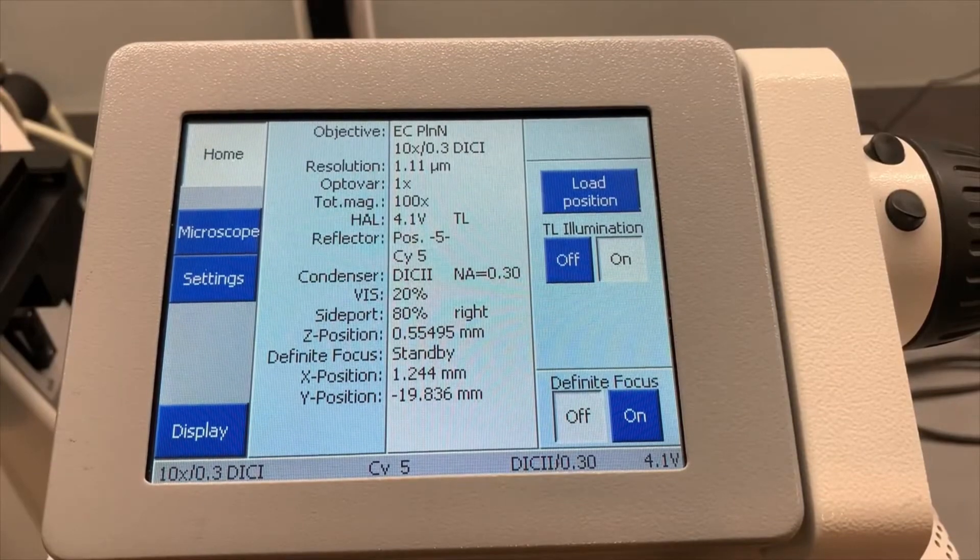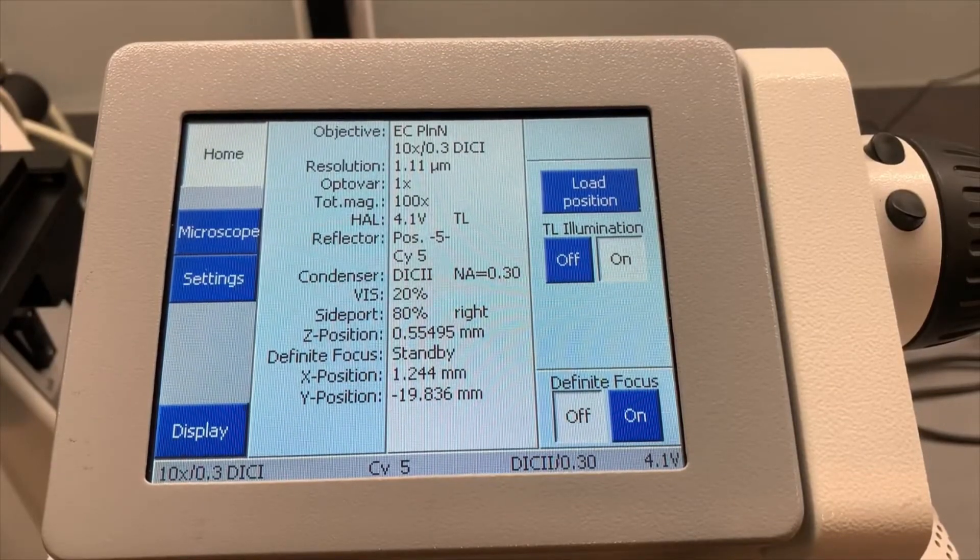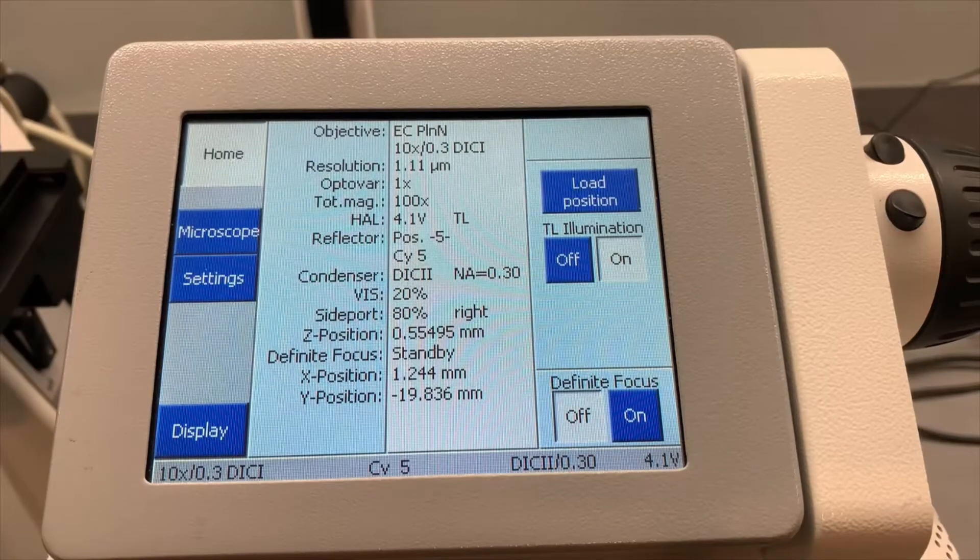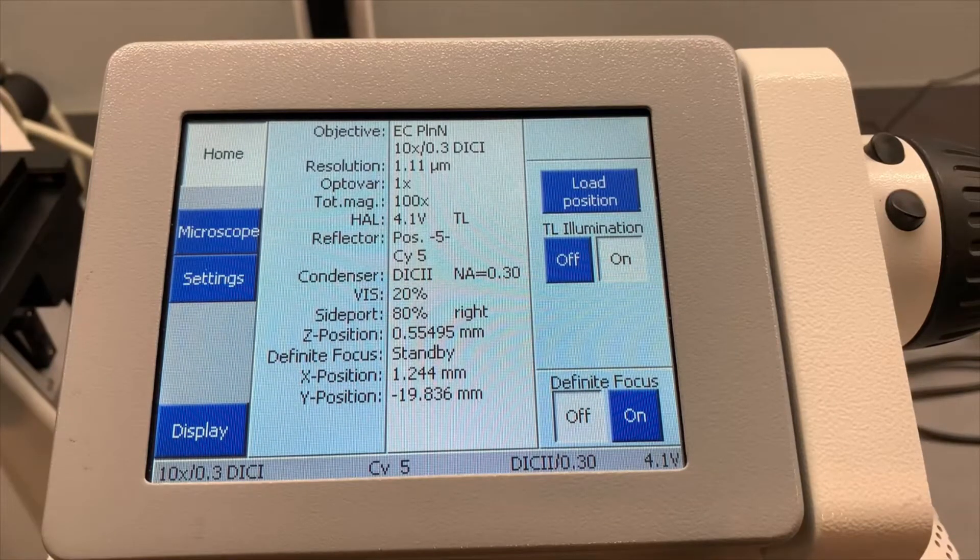and put onto this controller here or you can use our third-party micromanager software for this or Visitron software as well, all that will be applicable in this setting.